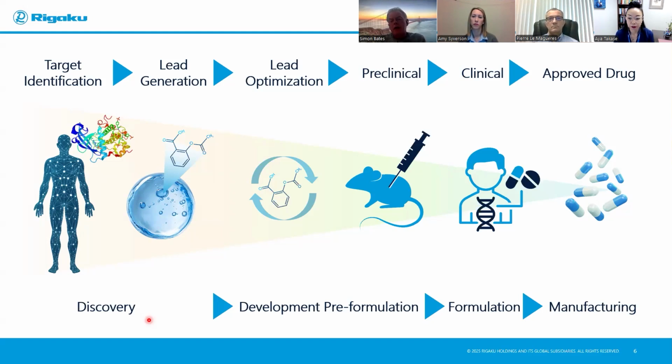And Pierre will start us off and he'll talk a little bit about single crystal structure analysis, how to get the structure, how to understand how that can lead you to the conclusions for how it is going to attach to the target sites associated with the pathology. And then following Pierre, we'll move on to Amy, and she'll talk about stock solution management, which is a key part of enabling the whole discovery process itself. So having said that, I'll pass you across to Pierre to talk about single crystal structure solution analysis.